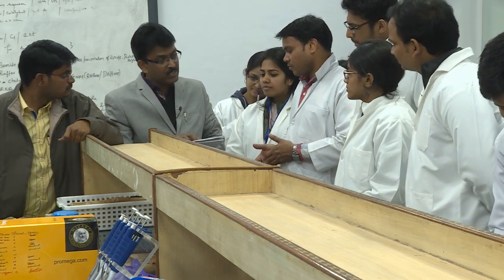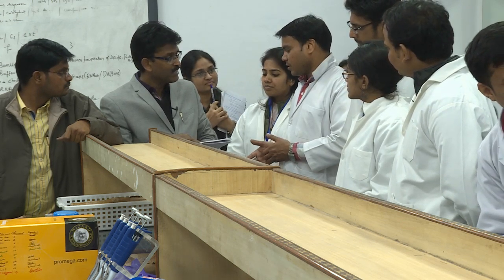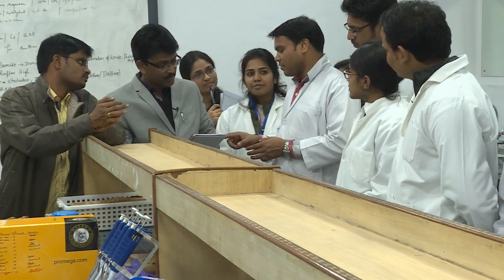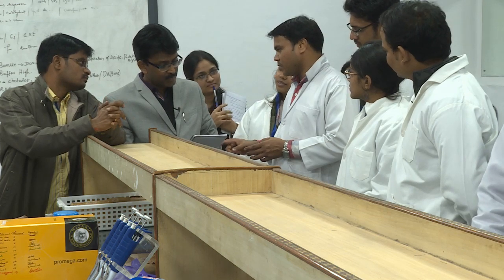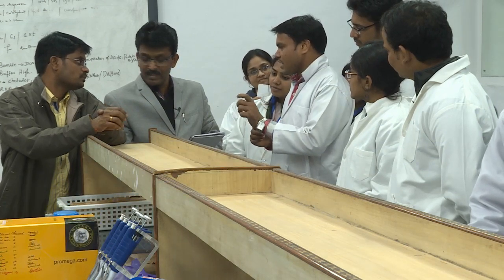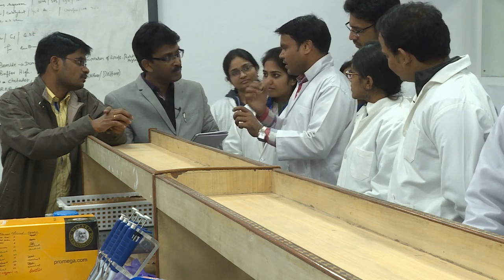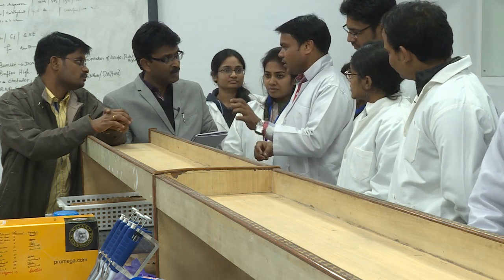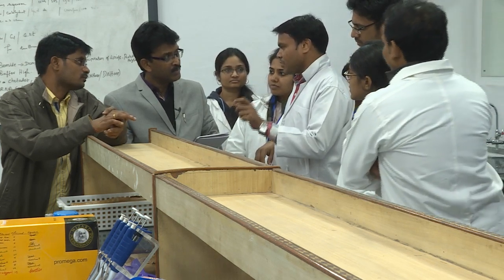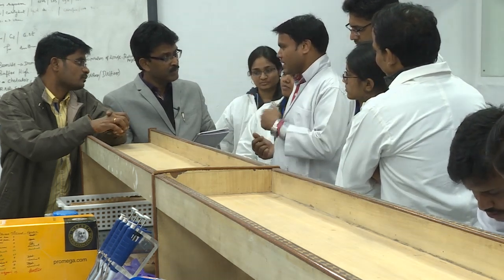But by the by, how did you segregate 2 samples? You handle only 2 samples, correct? Now it becomes 4 samples now. 2 samples only, sir. It becomes 4 later on when 2 went for scooping and 2 went for centrifugation. The same 2 tubes which we were handling. So we scooped into new tubes we have created, and the old ones we went for centrifugation also. At the isopropanol step we did the scooping, and 2 new tubes we created, 1 new tube for each sample.